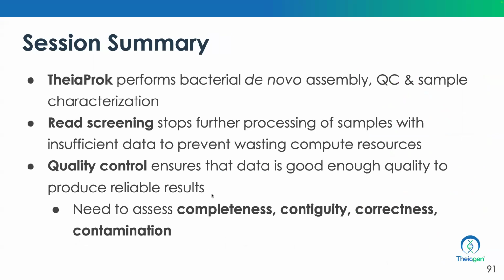All right, so what we've covered is TheiaProk performs bacterial de novo assembly, QC, and sample characterization. You've seen that there's read screening that allows the workflow to stop if there's an insufficient amount of data. And then we have quality control steps that ensure that the data is good enough to produce high quality genomes, where we assess the completeness, contiguity, correctness, and contamination of the samples.